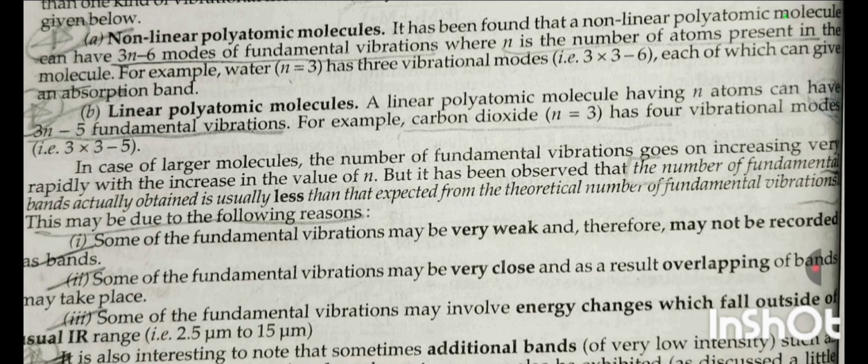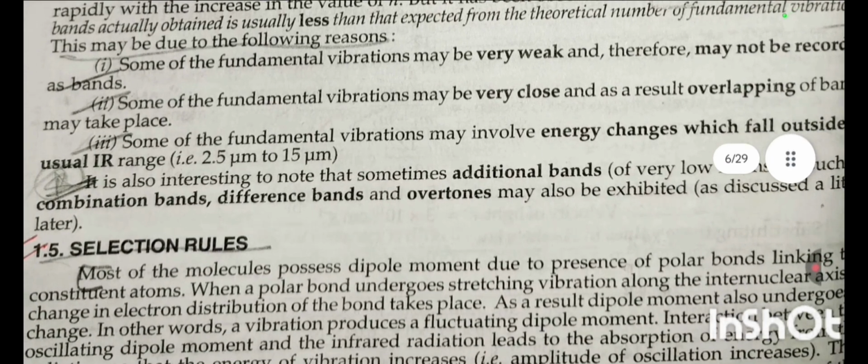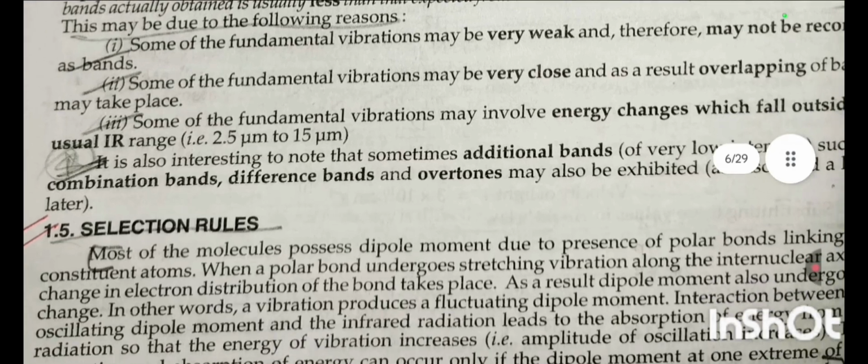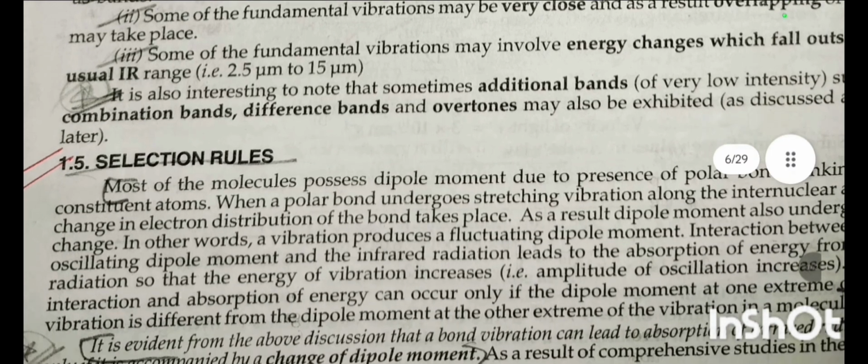Some of the fundamental vibrations may be very weak and therefore may not be recorded as bands. Some of the fundamental vibrations may be very close and result in overlapping of bands. Some of the fundamental vibrations involve energy changes which fall outside the usual IR range.